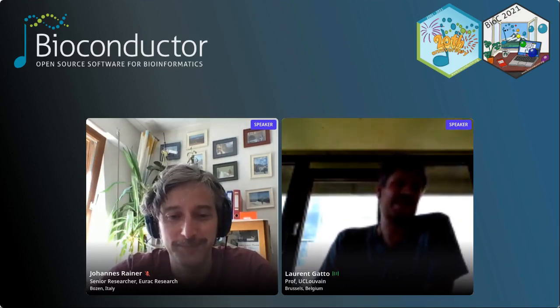I think the presentation, which was more metabolomics oriented, and some of the questions that are proteomics related, really show that this collaborative development worked, because it's of interest to different communities, although they use the same technology. To that extent, I think it's a nice deliverable.